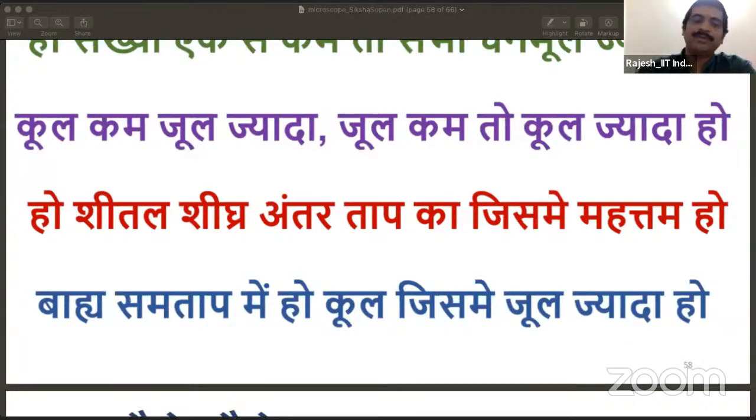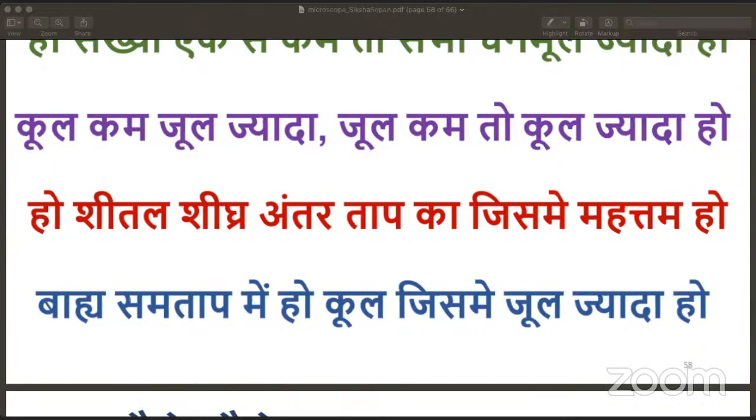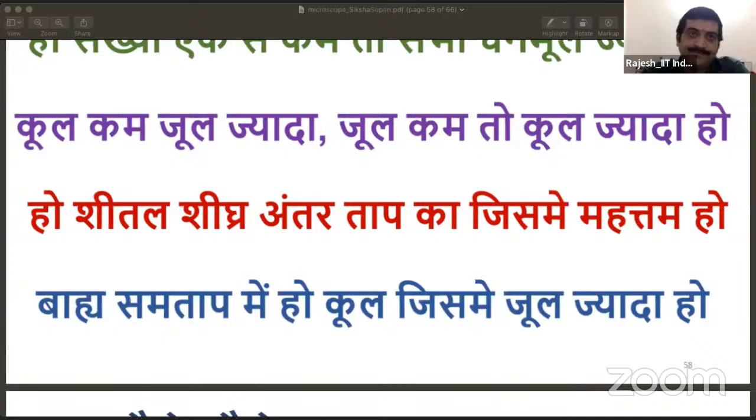So for copper, the energy difference is indeed in kilo electron volts, and the corresponding photon energy is also like that, and the wavelength will be in the X-ray region of electromagnetic waves. Because there the target used is copper, and that wavelength is, I think, one angstrom.